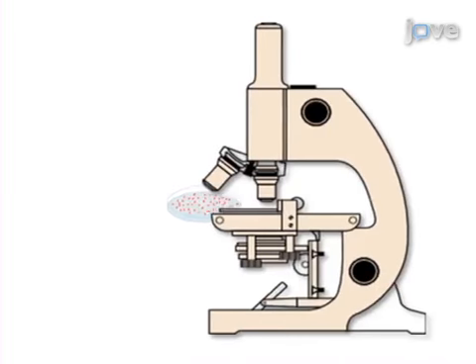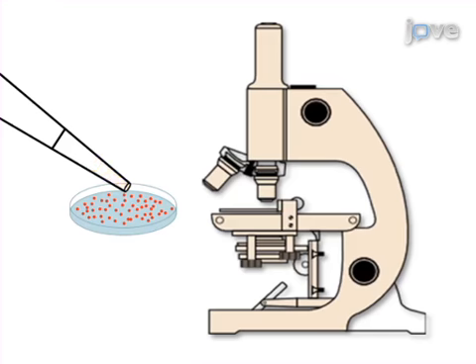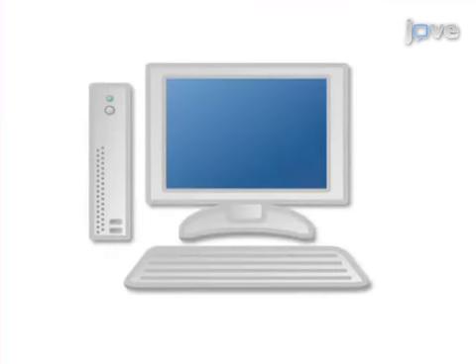Next, acquire a series of control videos showing the fluorescently labeled cells under normal conditions. Then apply an appropriate treatment and capture data of the treatment effects on the fluorescent cells. Process and analyze the video data for spatiotemporal relationships of proteins.